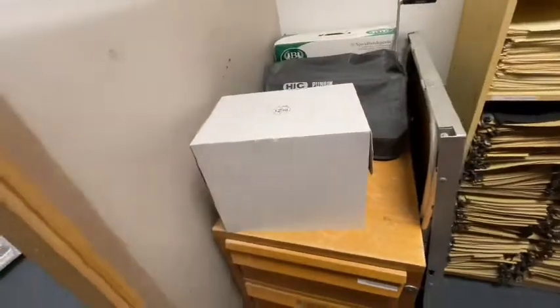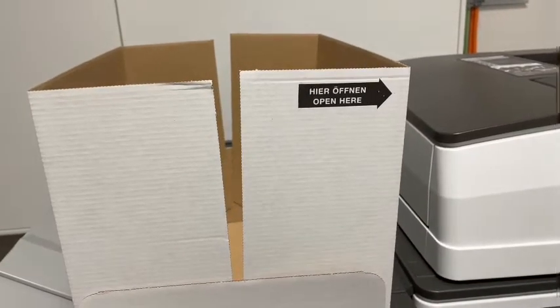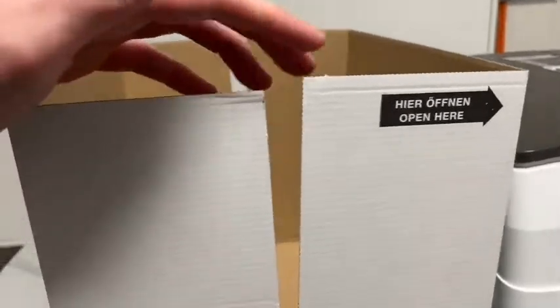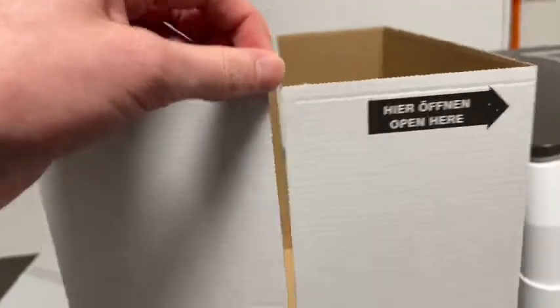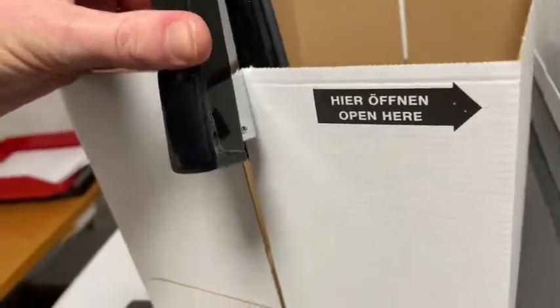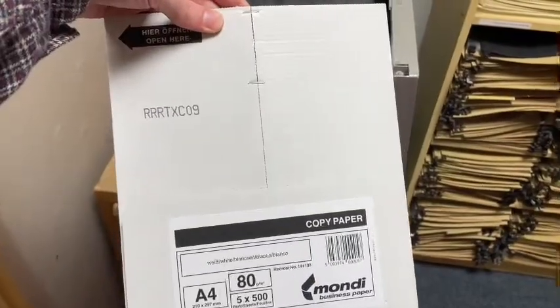I don't really need the lid, because what I'm going to do is place it over the beakers like this, okay? You'll notice that some of these boxes have a wide gap, and I don't want that because I don't want to let light into my dark experiment. So I will close that, and then use a stapler to staple those two things together so that it's stapled shut.